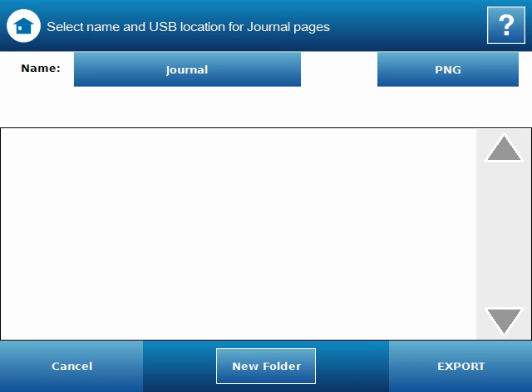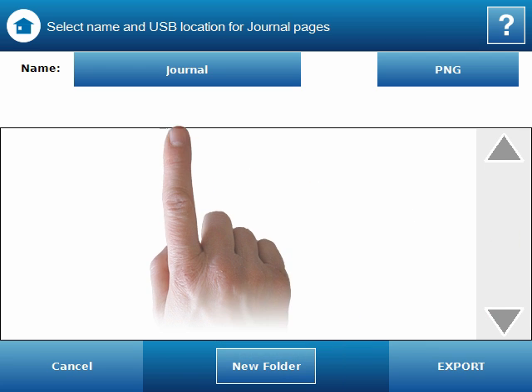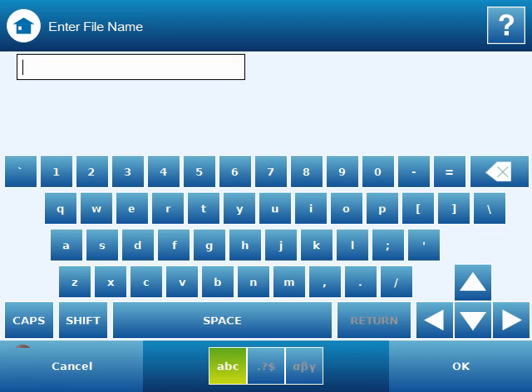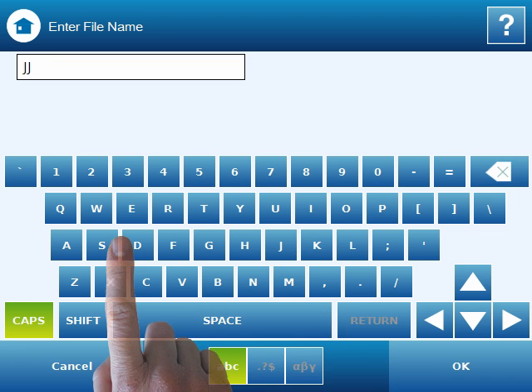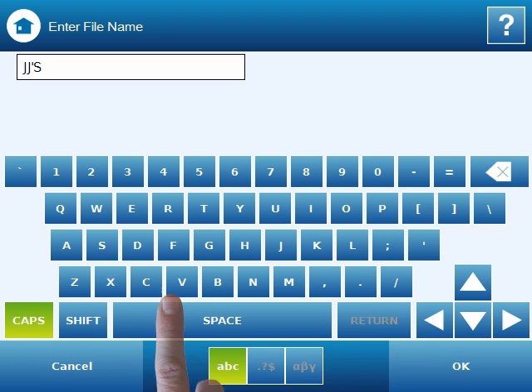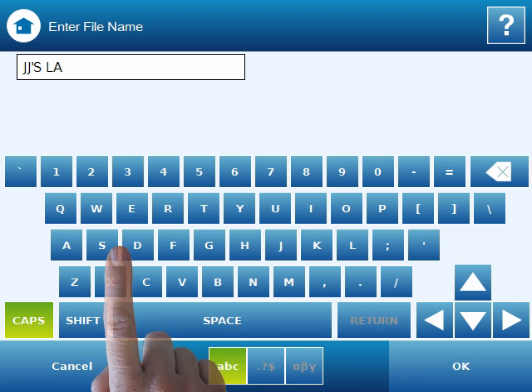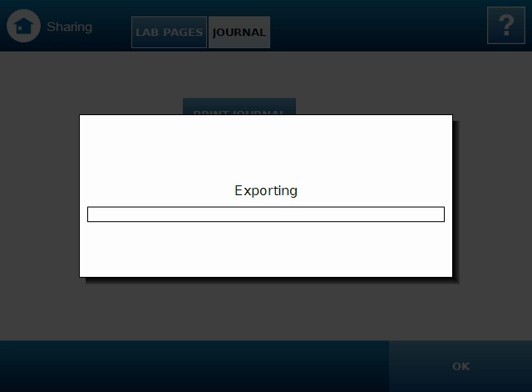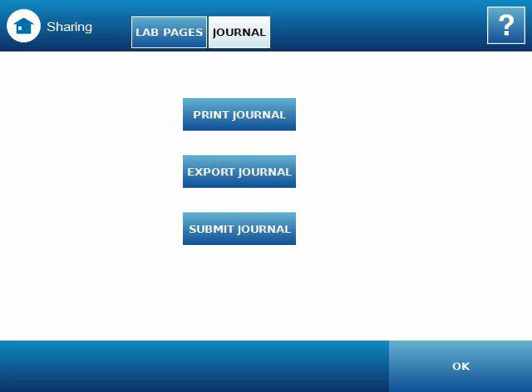In this screen, students have the option to give their journal a unique name to differentiate it when turning in files. Once the export is complete, simply remove the flash drive and plug it into a computer.